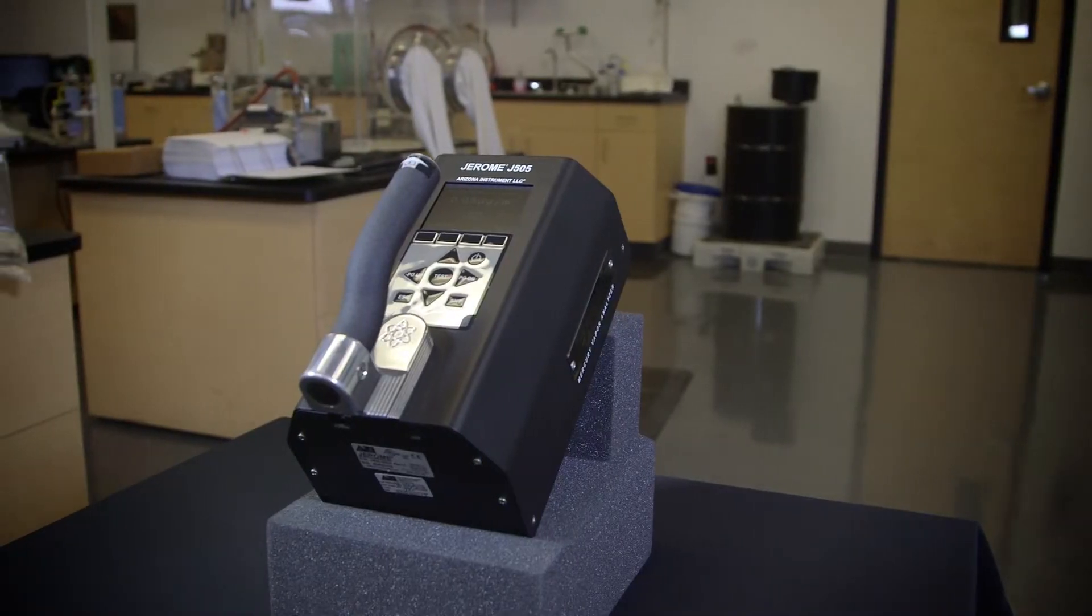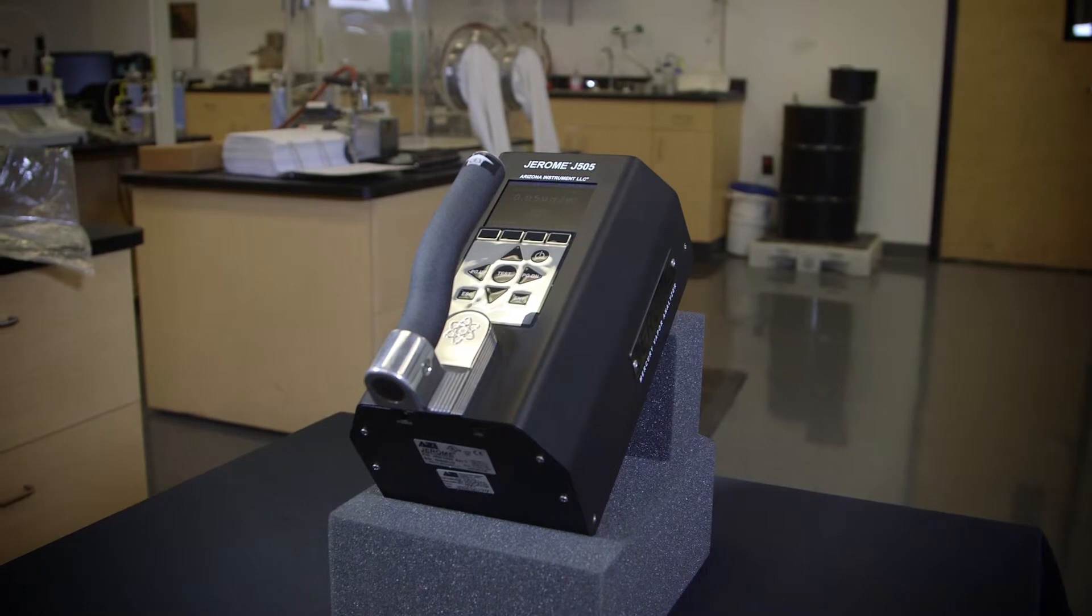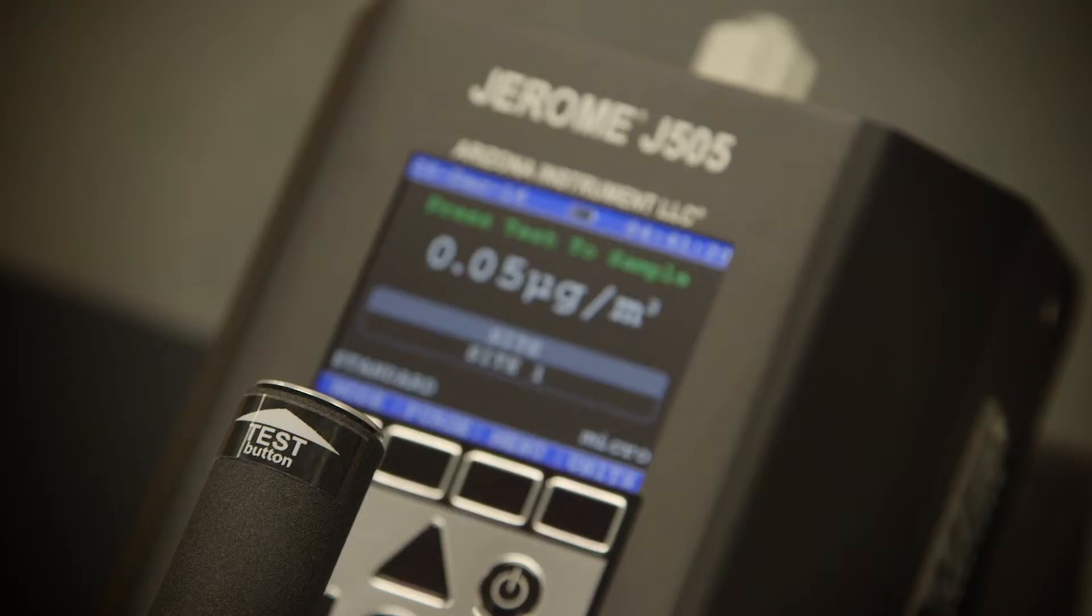Because the J505 uses atomic fluorescence to detect mercury, no regenerations or downtime are required. It features a color display and an easy-to-use menu system with a battery life of more than 10 hours.